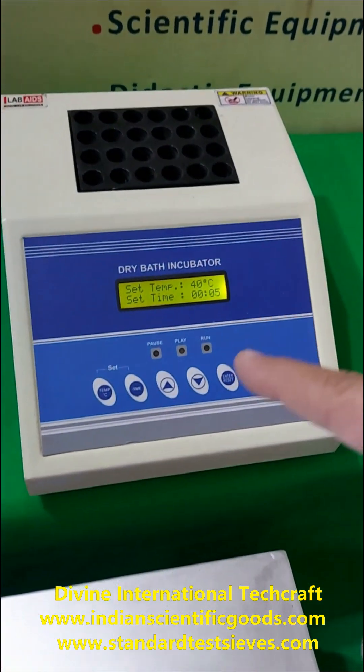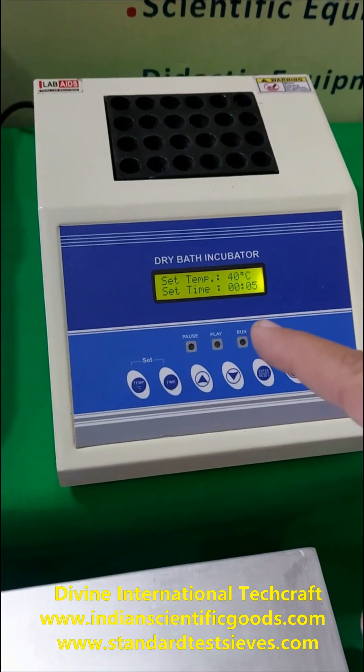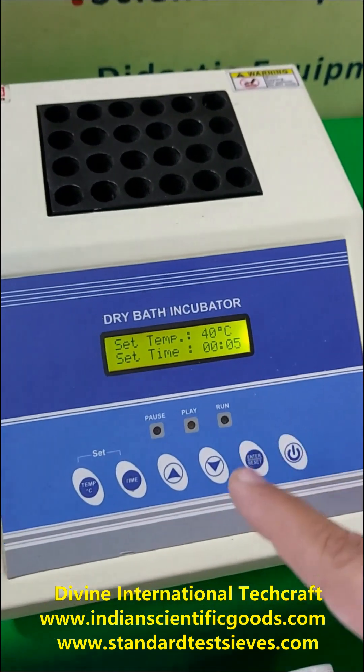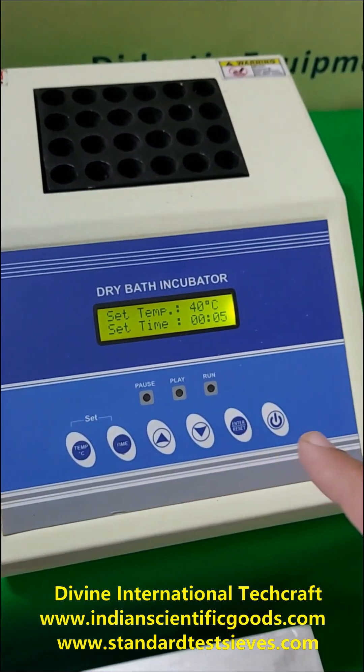These block heaters have a digital temperature display. Heating temperature and time duration can be set using the feather touch keys.